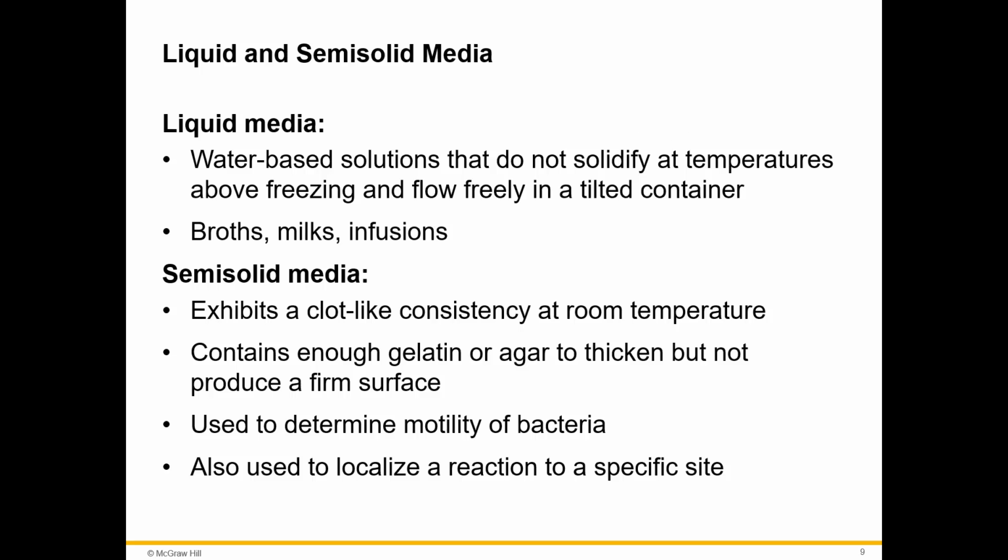Why do we care? Well, if you want to identify the bacteria, you need to make a list of all of its characteristics. Those characteristics can help us identify it, especially with those enteric pathogens. If you know that it's a non-motile gram-negative rod that came out of the digestive tract, you can start to think of the species of bacteria that are not motile. It could be Klebsiella. So it can help us start to examine these characteristics in order to determine an identity. And that's really the goal, and that's what I'm going to focus on in this course: identifying human pathogens and trying to figure out what is the causative or infectious agent.